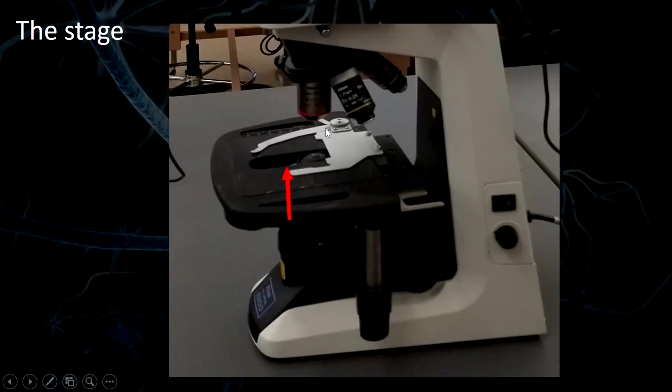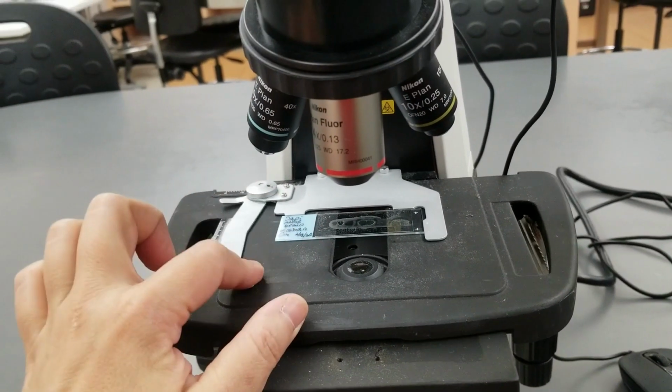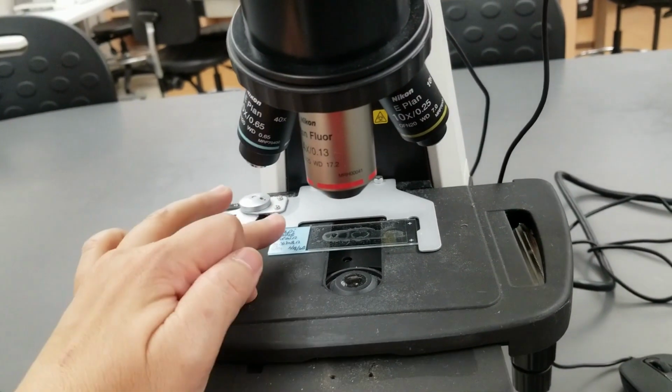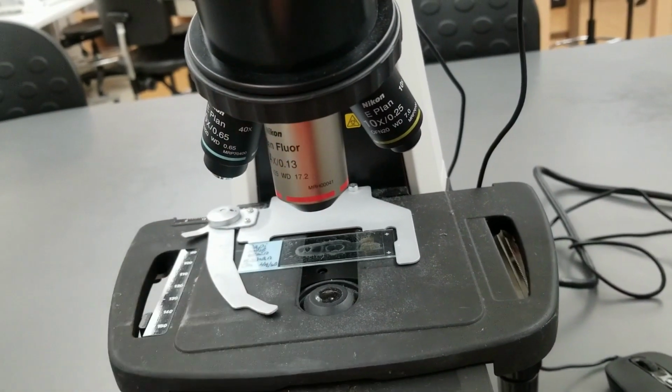And there's a platform, which is this black piece with the clip. We call this thing the stage. We put samples on the stage, and we can control where the stage goes by turning the knobs. We put our slides on this clip. When you move the clip, you'll be able to slide your slides in and clip them here.